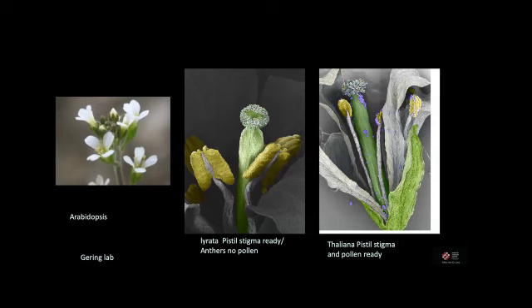So while SEM is not highly used by biologists, I would encourage you to think about adding it to your studies. This is a study I was working on with Mary Gehring at Whitehead Institute. She's studying Arabidopsis and the epigenetics of seed formation, and we decided to do some SEM on her plants. There are two ways a seed can be produced within a flower. The flower can be cross-pollinated, or it can self-pollinate.